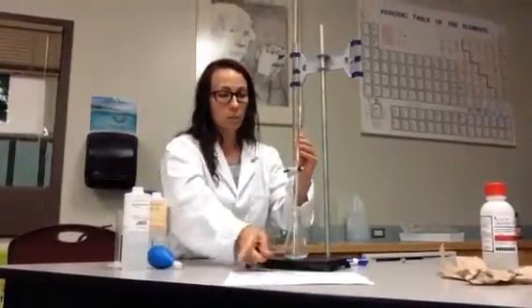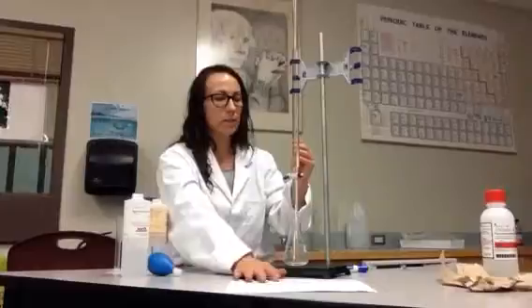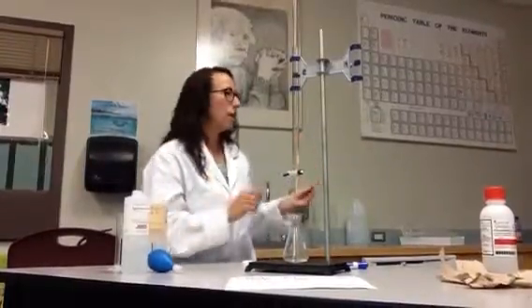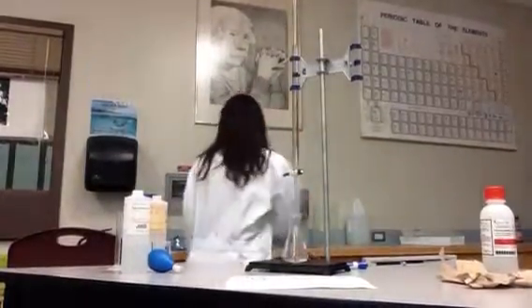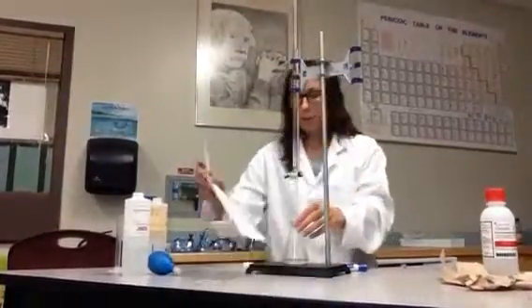And then I'll have a concentration, a volume, a 1-to-1 ratio as I cross the bridge, and a volume, and I'm finding the concentration. Everybody get it? So the math itself is exactly what you were doing yesterday, but the apparatus is far more complicated. If I put a white sheet underneath, I can see.